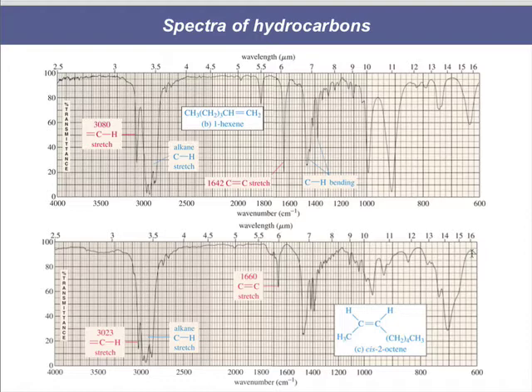And it also doesn't tell us what is connected to what. It does not tell us whether this is, for example, cis or trans 2-octene. Or maybe this could be a 3-octene or a 1-octene. It can be very difficult to tell that in an IR spectrum. On the other hand, that information is very easy to obtain by NMR.